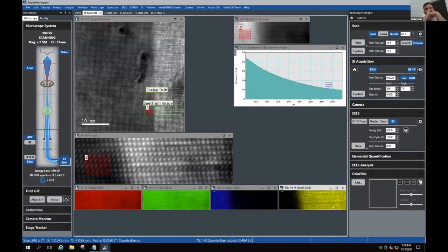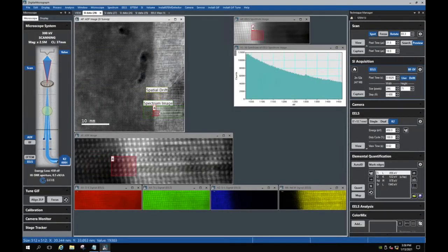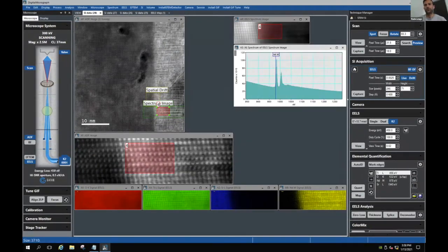Do you actually want to switch to TEM imaging and we do some low dose imaging? We should do an extended fine structure and then switch to TEM, I think. Yeah, let's see this one for the new neodymium here. Oh, and did you want to do a quick MLLS analysis of this to show the change in titanium oxidation state? Oh, yeah, we could do that. Okay, so let's focus on that.